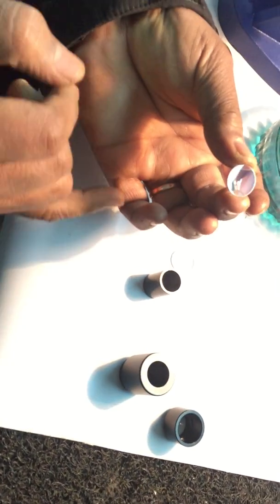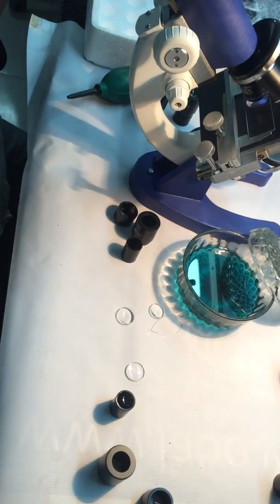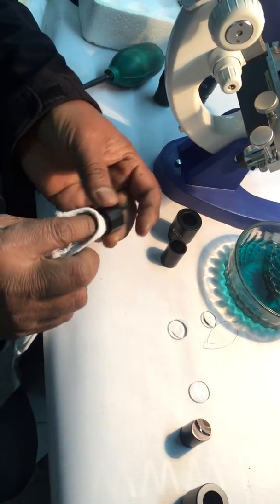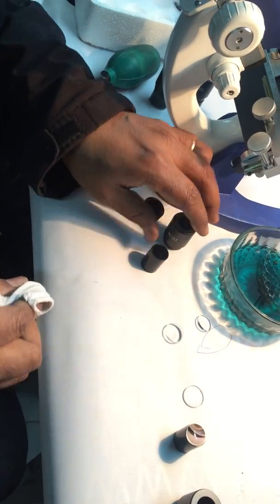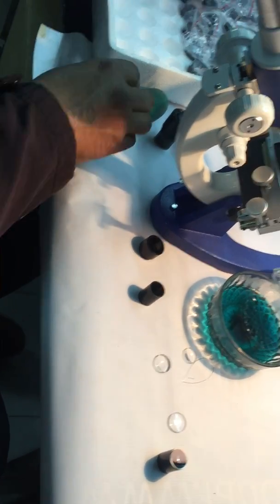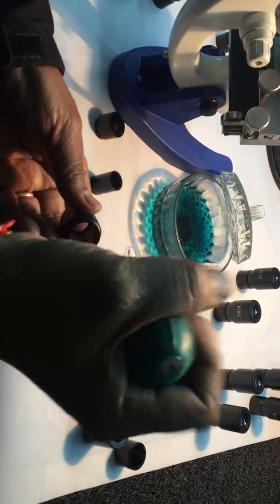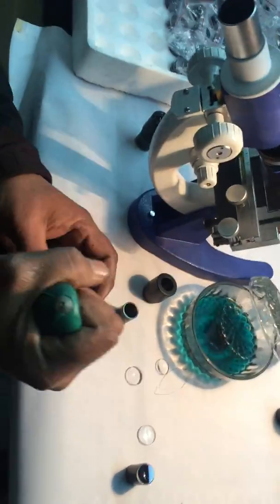So we will show you the cleaning process. We will clean all the components — we will take a clean cloth. Remove dust using the air blower. In case any particle is left inside, we have to air blow that.